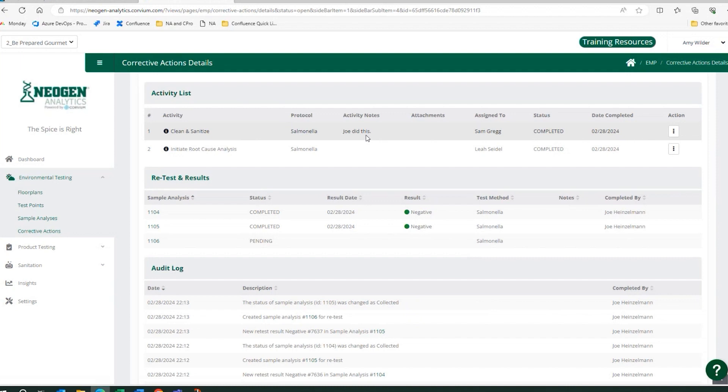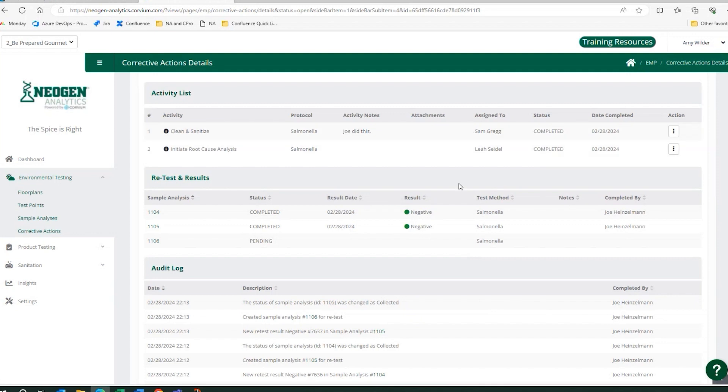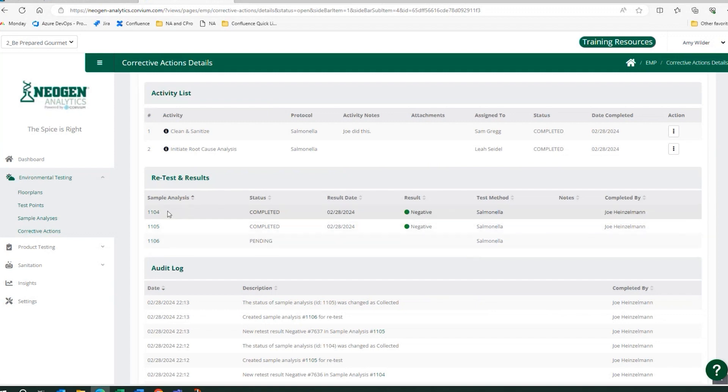You could capture notes upon completing this activity. You would mark it complete as you would the remaining activities. And then the software is going to automatically generate a sample analysis for my retests.